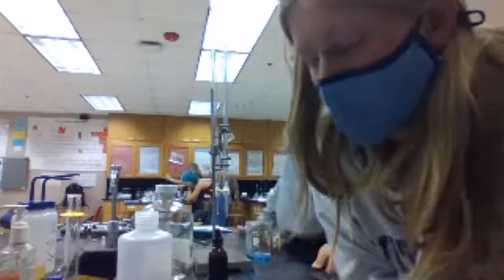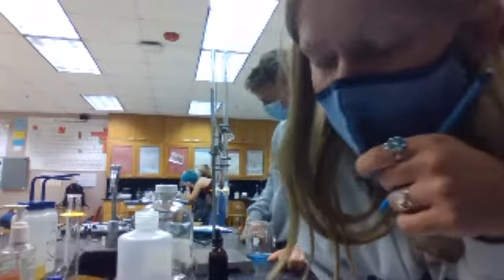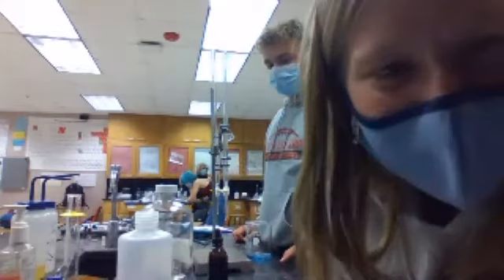Okay, so Peter and I both got for VB, which is 38.00 minus 28.40. We got 9.6. Okay, cool. All right, so now we're just going to keep taking milliliters and fill out the graph. I don't know how long we're going to go.